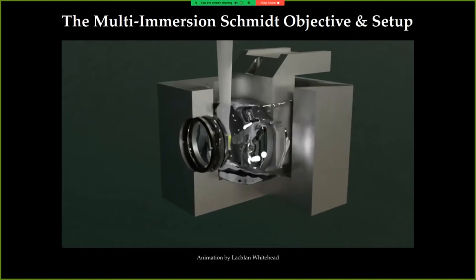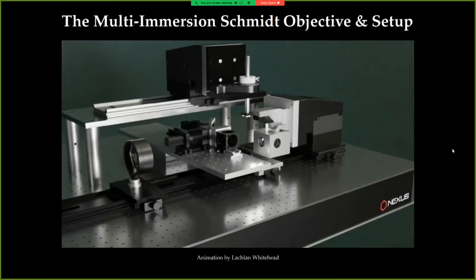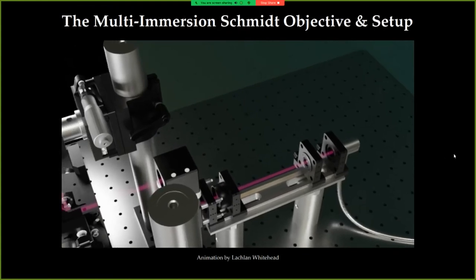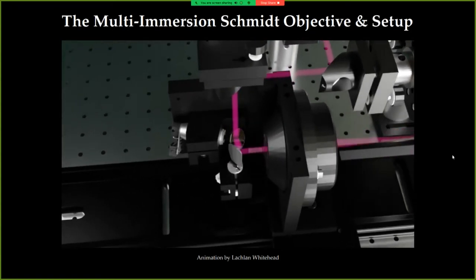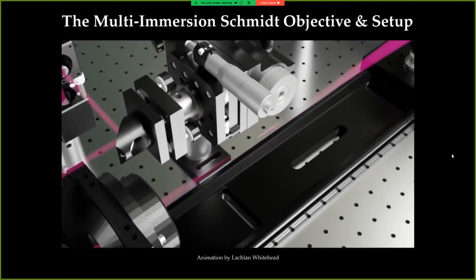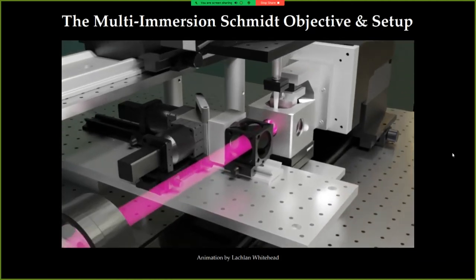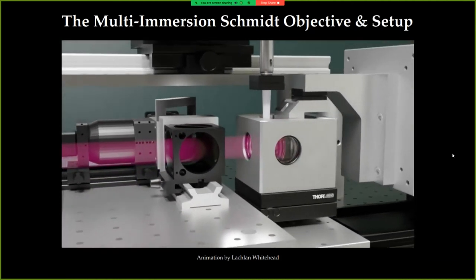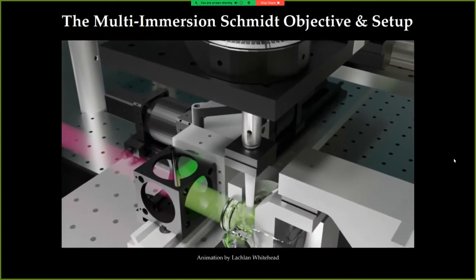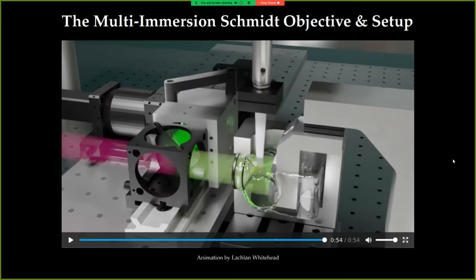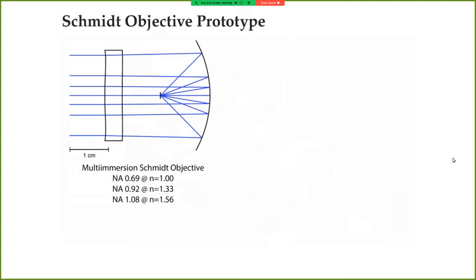We can then integrate this design into a two-photon microscope, which is basically super similar to completely standard two-photon microscopes, with the only difference being that the system is horizontal instead of vertical or upright or inverted. And so we have some galvo scanners scanning the beam. And then we have a combination of a scanning tube lens, which is expanding the beam to inject it into the microscope objective. And the emitted fluorescence from the two-photon excitation is then caught by the mirror and reflected back towards the excitation path. And then we have a dichroic and a detection system with a few photomultipliers completely comparable to a normal two-photon microscope. And so this is what the actual cross section of the optical design looks like. So you see it roughly has an aperture of 22 millimeters. And this system operates as a multi-immersion Schmidt microscope objective with a numerical aperture of 0.69 in air. And then the numerical aperture increases towards higher and higher indices up to 1.08 at an index of 1.56.